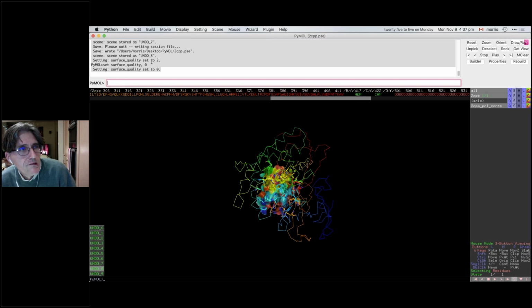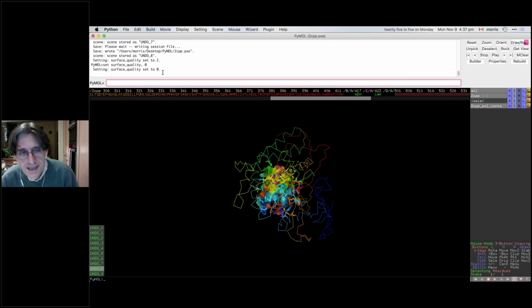Normally on Linux it's Control C, but in a terminal you might need to use Shift Control V instead of just Control V. The reason being that Control C in the terminal actually interrupts the process. So in the terminal, you normally have to use Shift Control C and Shift Control V. Okay, that sounds great. Hopefully that makes sense.